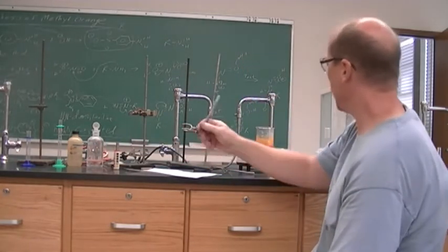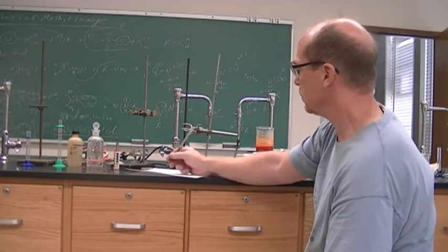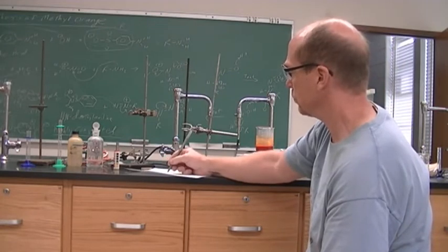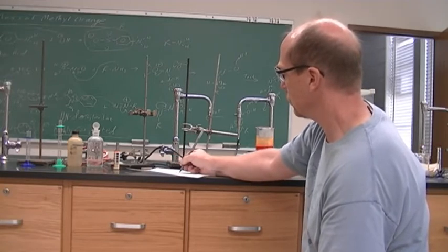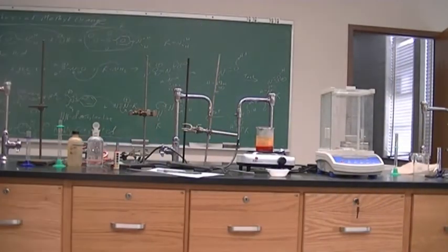All right, we're just going to bring this to a boil, and then we're going to take it off. All right, I'm going to get some ice.